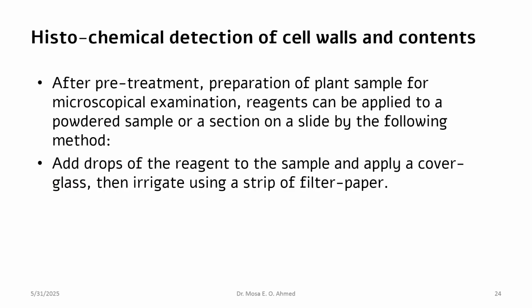Histochemical examination of cell content means the use of chemical reagents to examine the histochemical structure or the microstructure of the sample. It always follows preparation of the sample, as in microscopical examination, such as the formation of a transverse section.